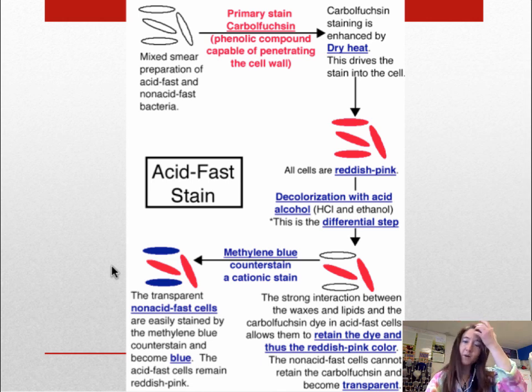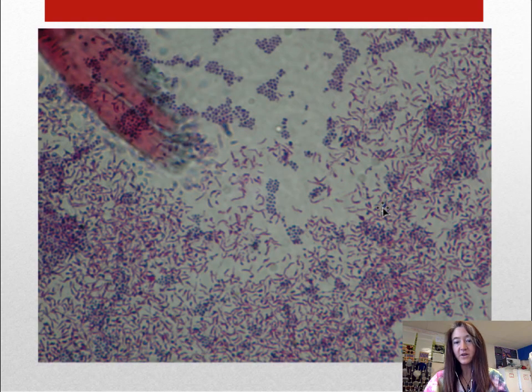However, Mycobacterium, our acid-fast bacteria, are going to be rods, although they're pleomorphic. That's the rad thing about them. Remember, pleomorphic means shape shifter. So depending upon the age of the culture, they'll kind of round over sometimes and be more coccus looking. But in our cultures, they should be fresh. And so we should see them as rods, these beautiful pink rods.